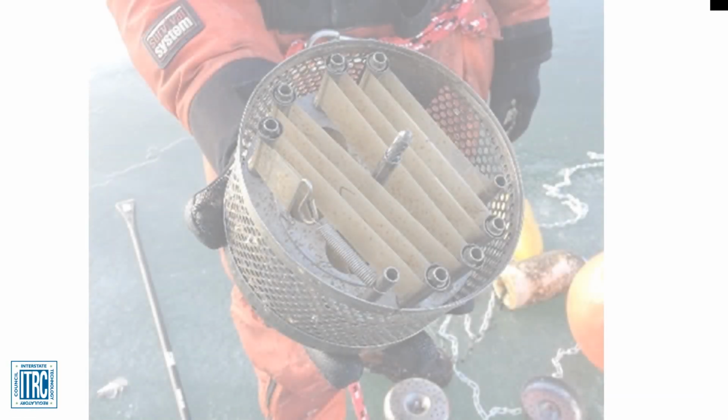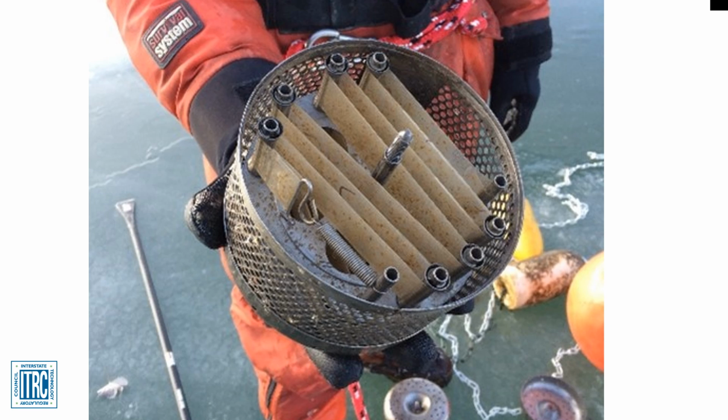Deployment time can range from days to months depending on the targeted chemicals of concern. The sampler in this photo was deployed in a river for 2 to 3 months, and you can see the buildup of biofilm that occurred. Once the deployment period has been achieved, the device is removed from the water and placed on ice in airtight shipping containers to be returned to the laboratory.